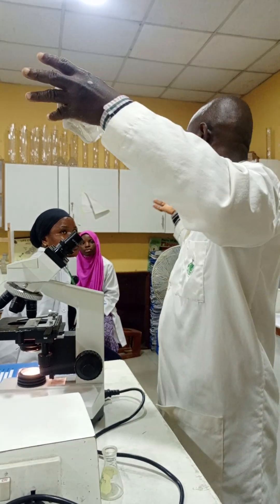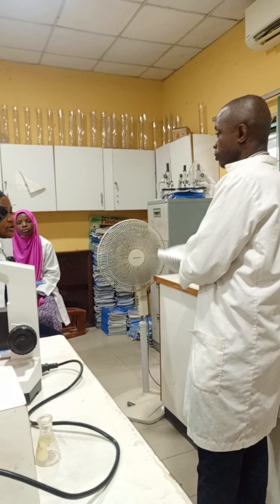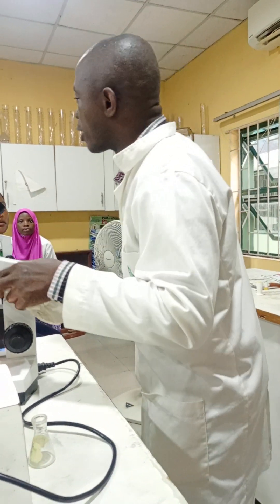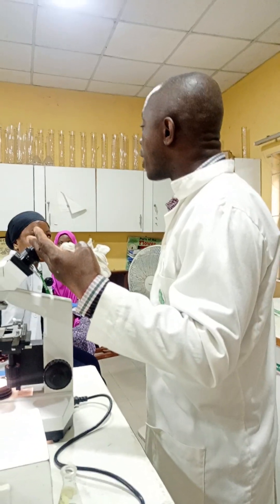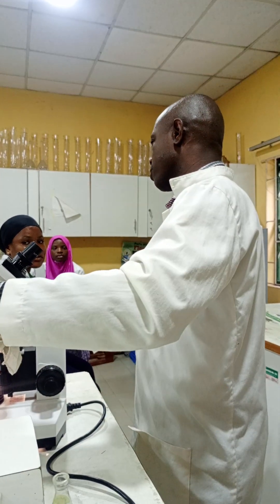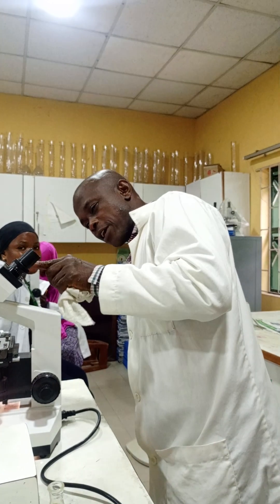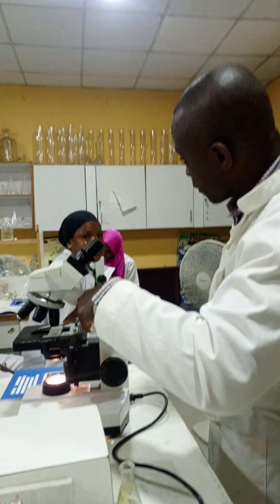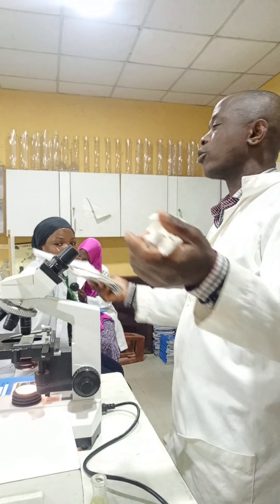Do you understand how to get magnification for specimens seen under the microscope? If your specimen is under the microscope, you multiply the eyepiece by the objective lens. The eyepiece is times 10, and the objective lens facing the slide is times 10, so your magnification is times 100.